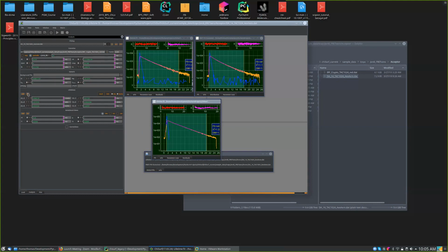Okay, just play a bit with the starting values. No, it won't get much better. So this beginning could never be described by the response function. So you have to cut it away. Okay. But maybe just check what it is.